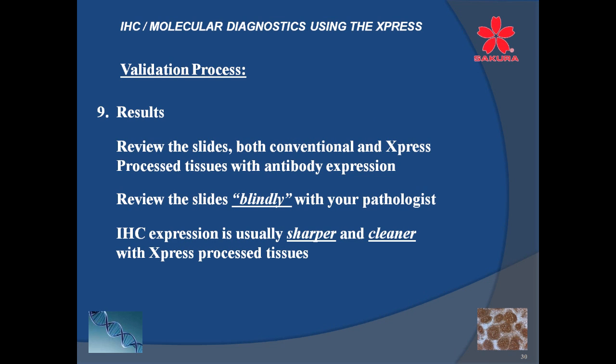Now the results, after you've stained the slides and coverslipped them, of course, labeled if that's required, reviewing the slides, both the conventional and Xpress process tissues, you'll get to see the antibody expression. Grossly, yes, you could see some results grossly, but microscopically is where you really find the uniqueness and the good quality.